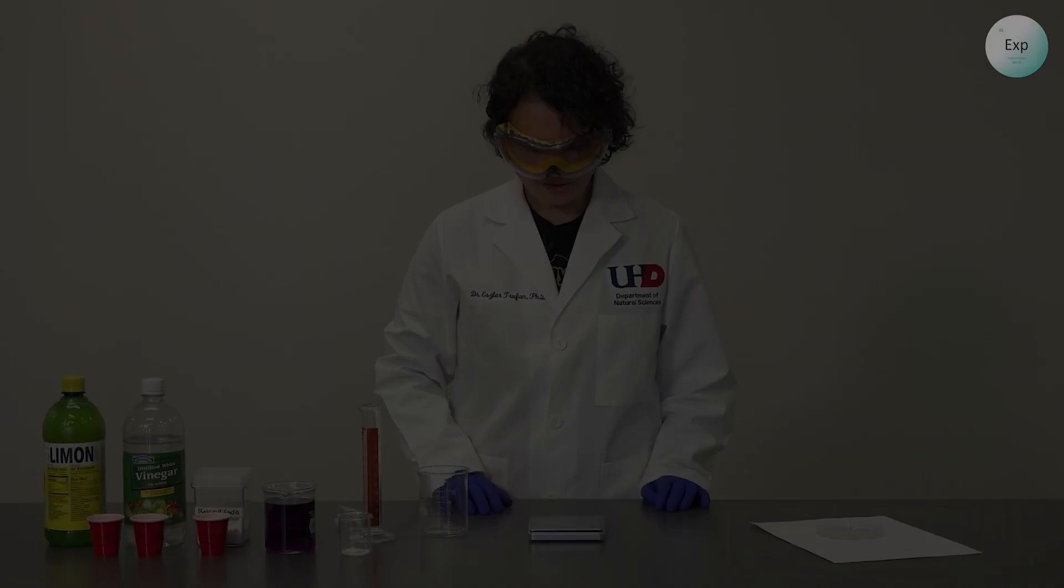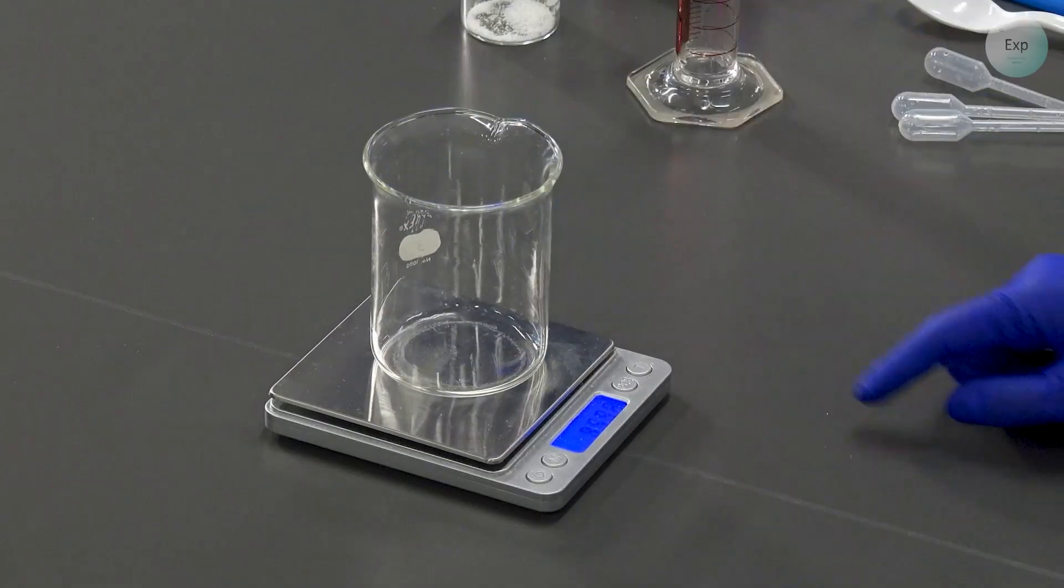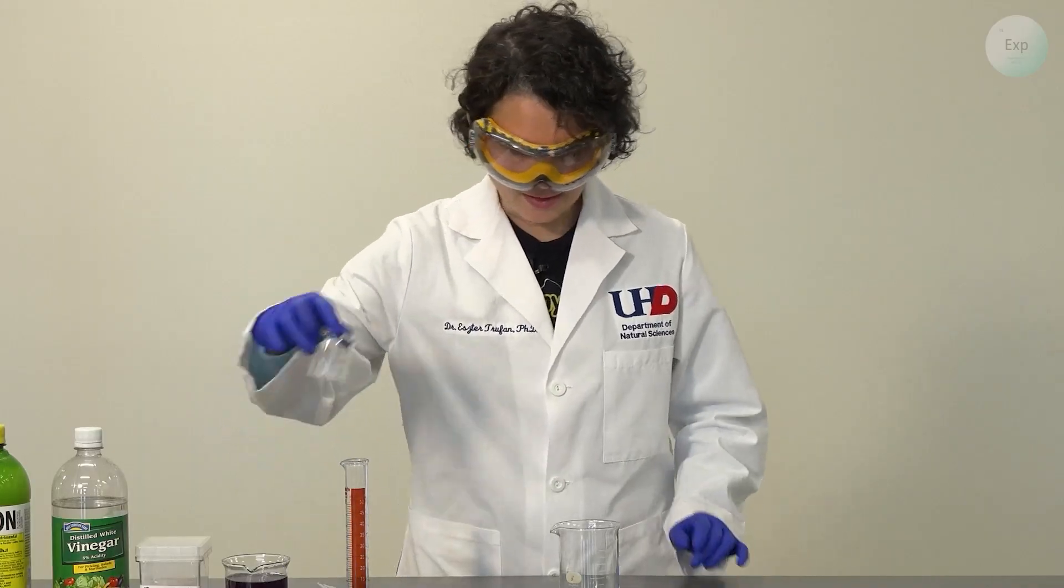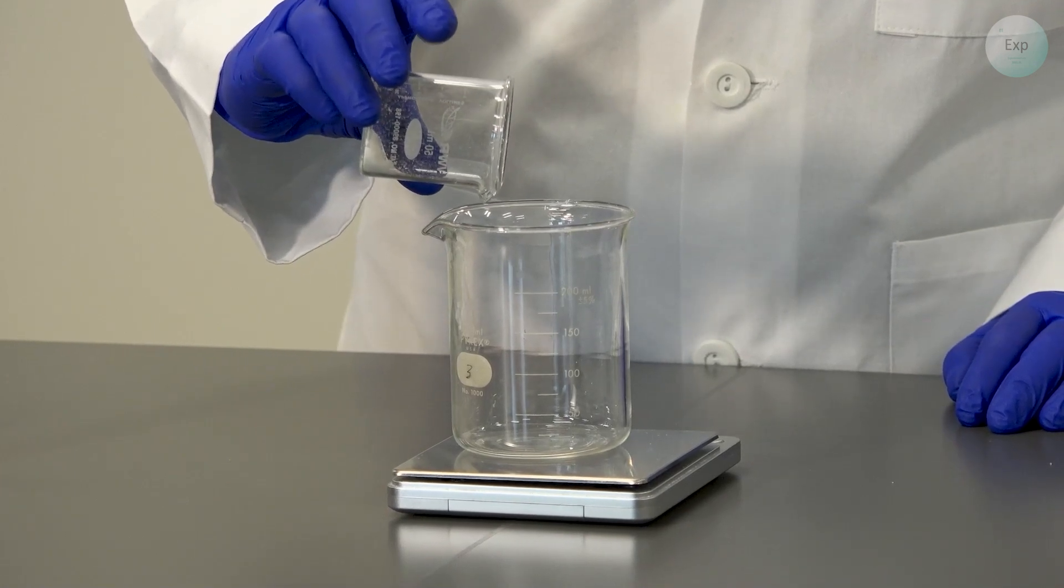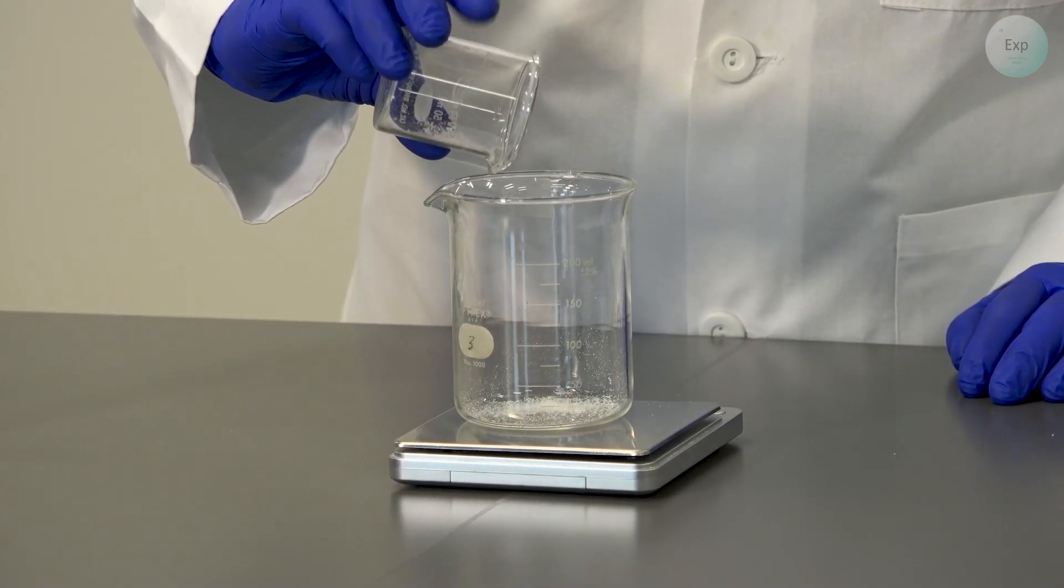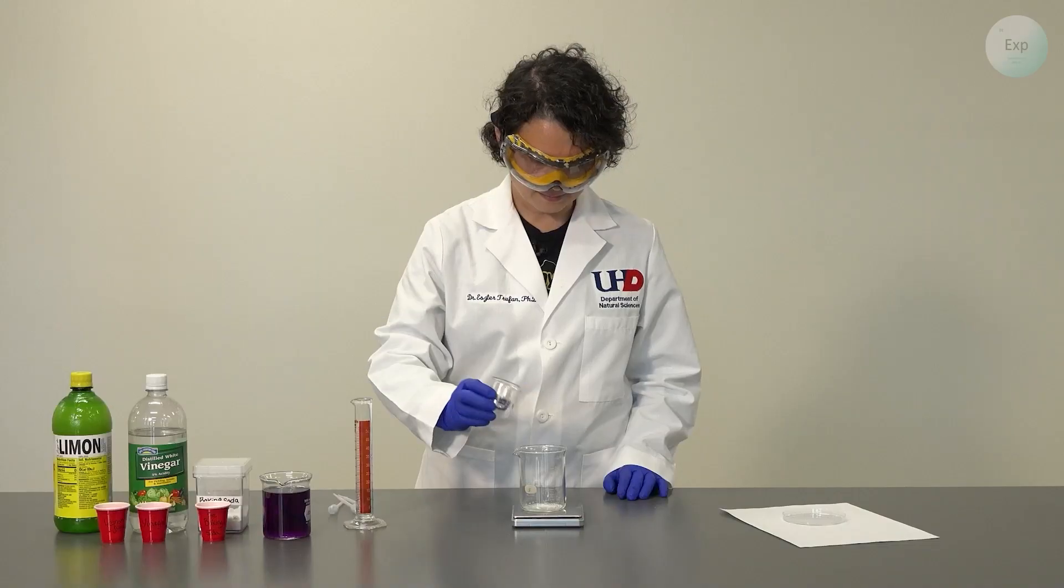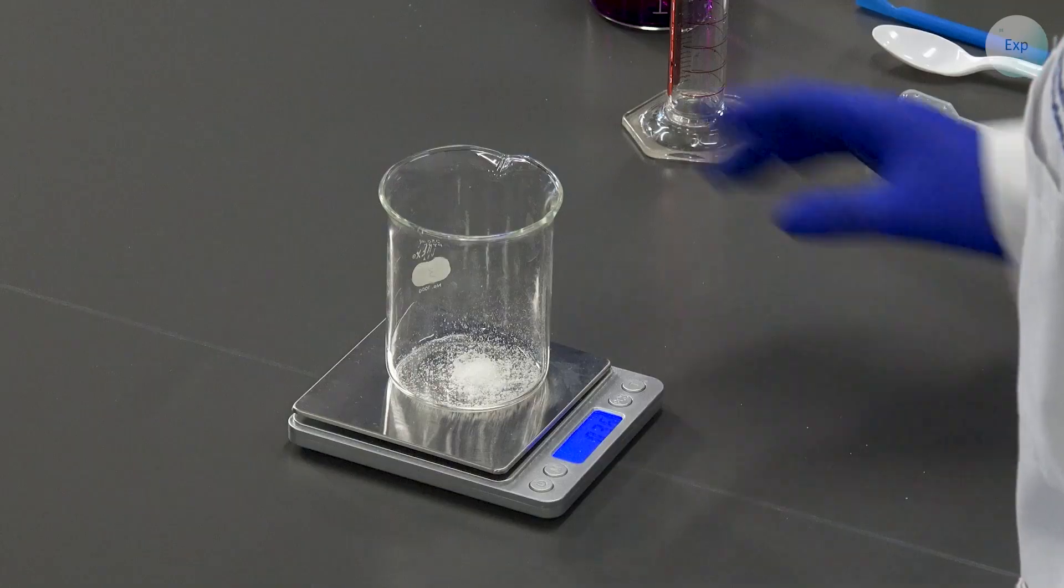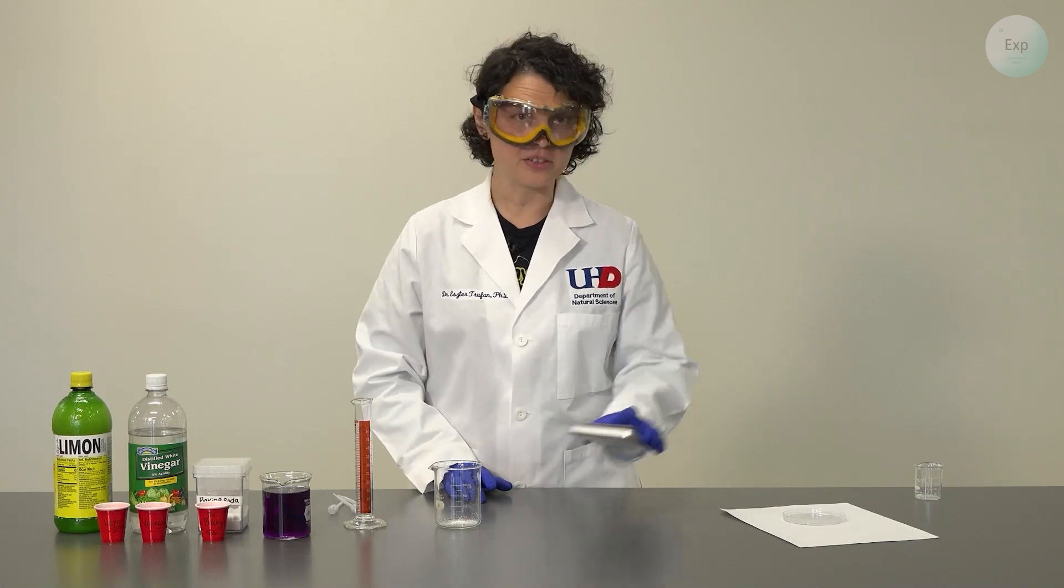So let's get started. To begin we're going to turn on our scale, place the beaker on top of it, tare it, and add the diaper polymer or sodium polyacrylate. I added 0.36 grams. With that I can set my scale to the side.